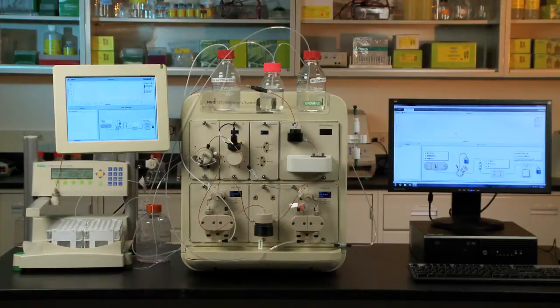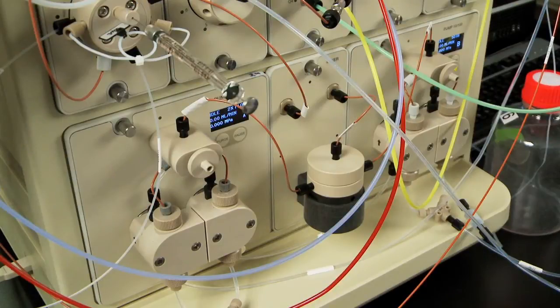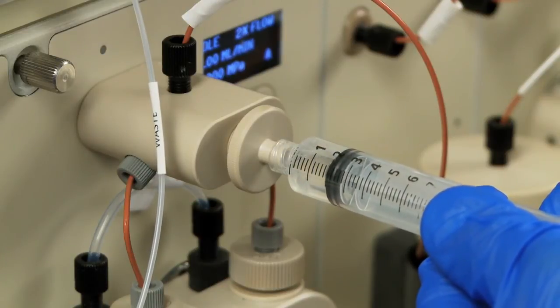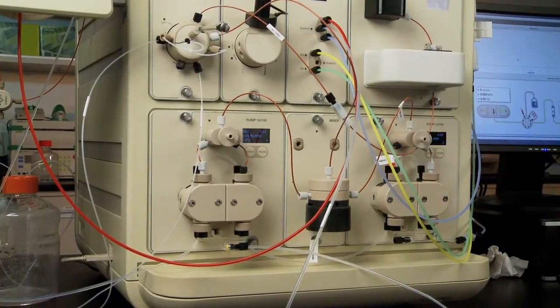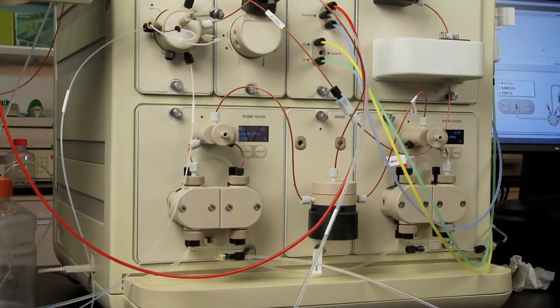You should purge your NGC system whenever you suspect air is downstream of the system pumps. Purging the system is also a good practice directly after priming a pump. You can purge the system using either the pump hardware faceplate or ChromeLab software. We'll demonstrate use of the hardware faceplate first.